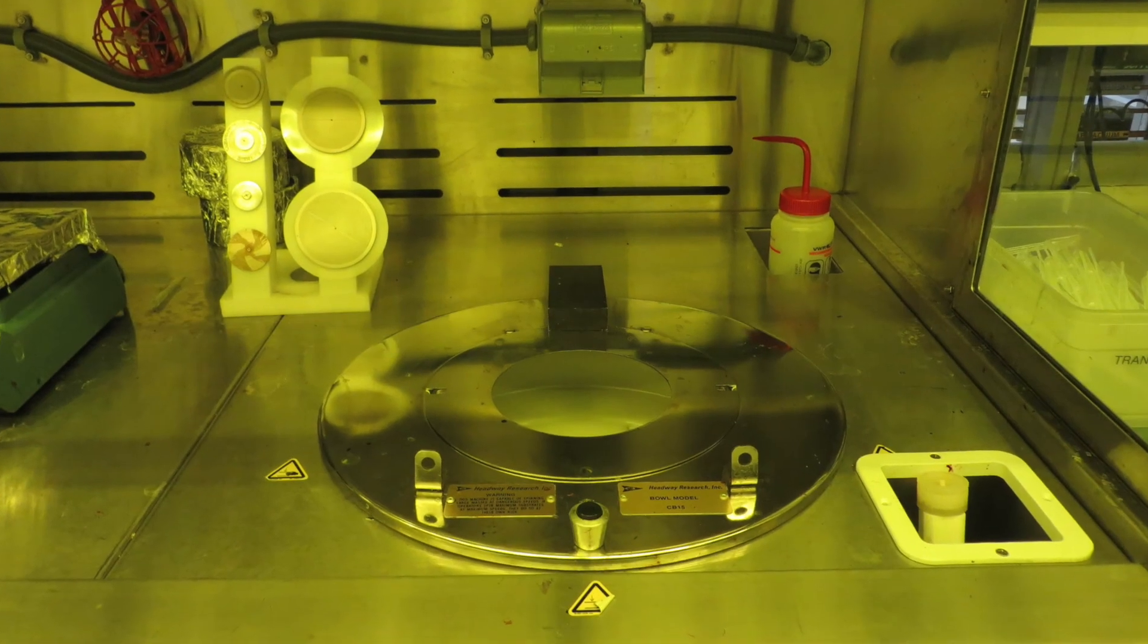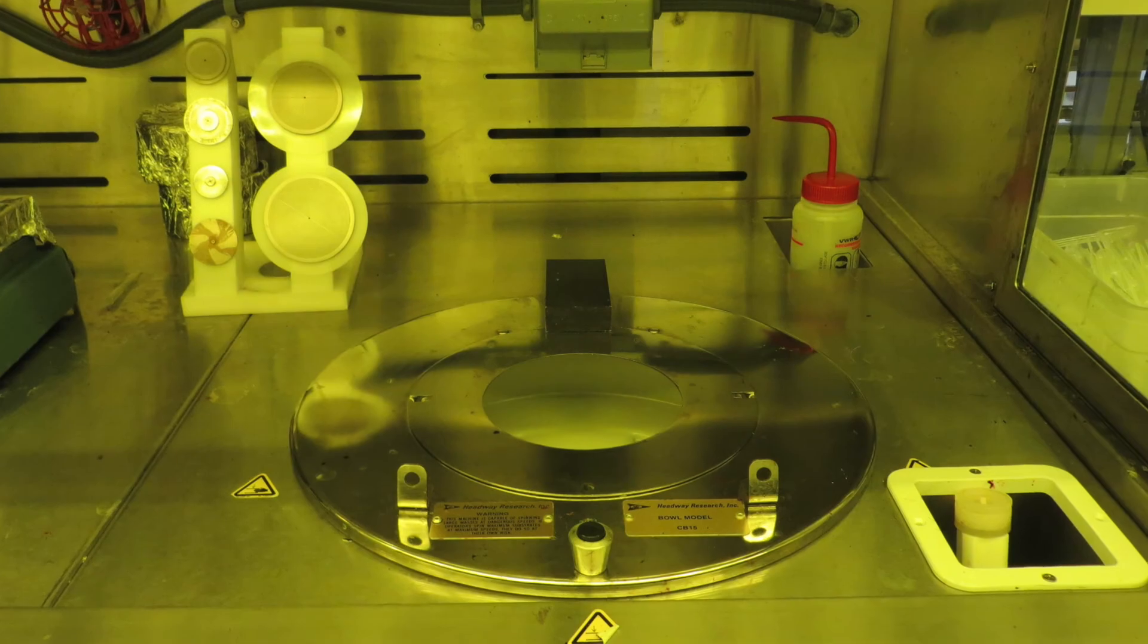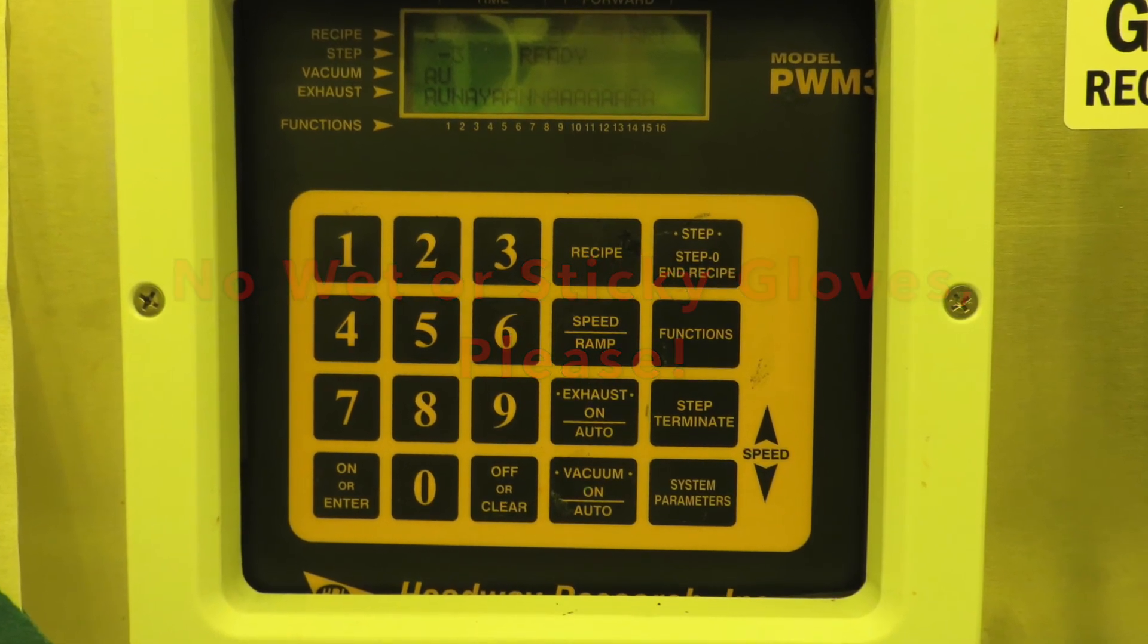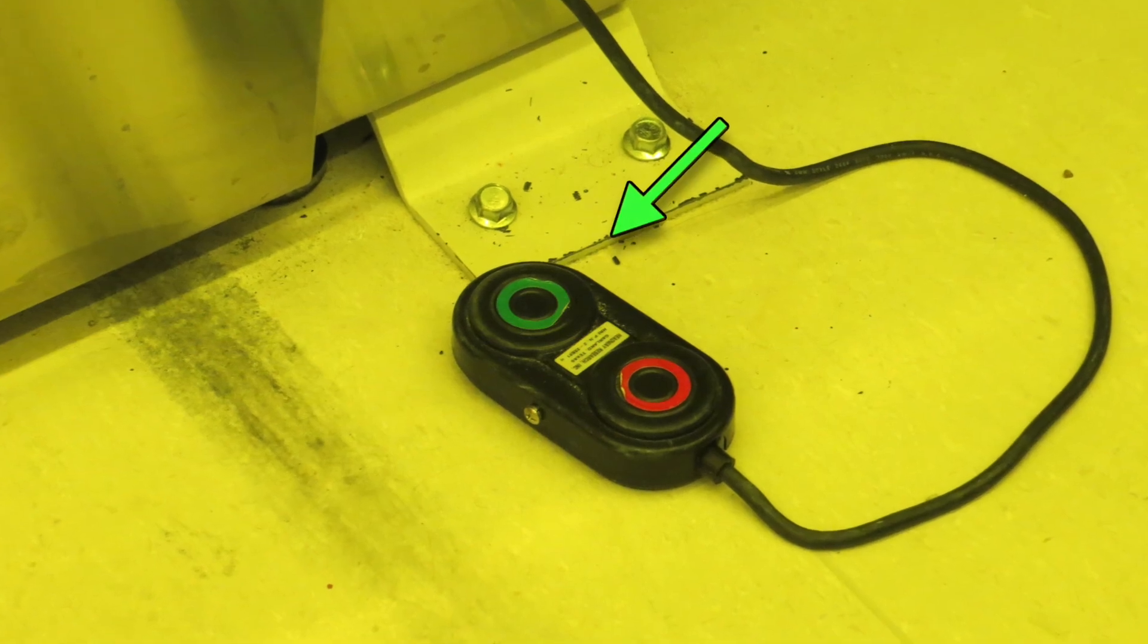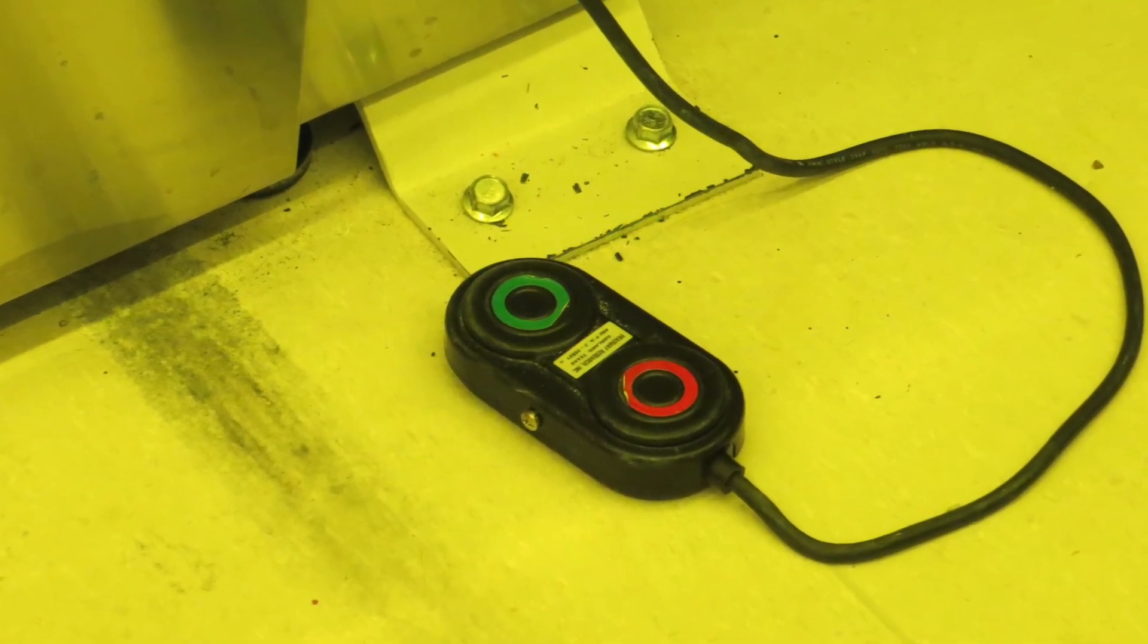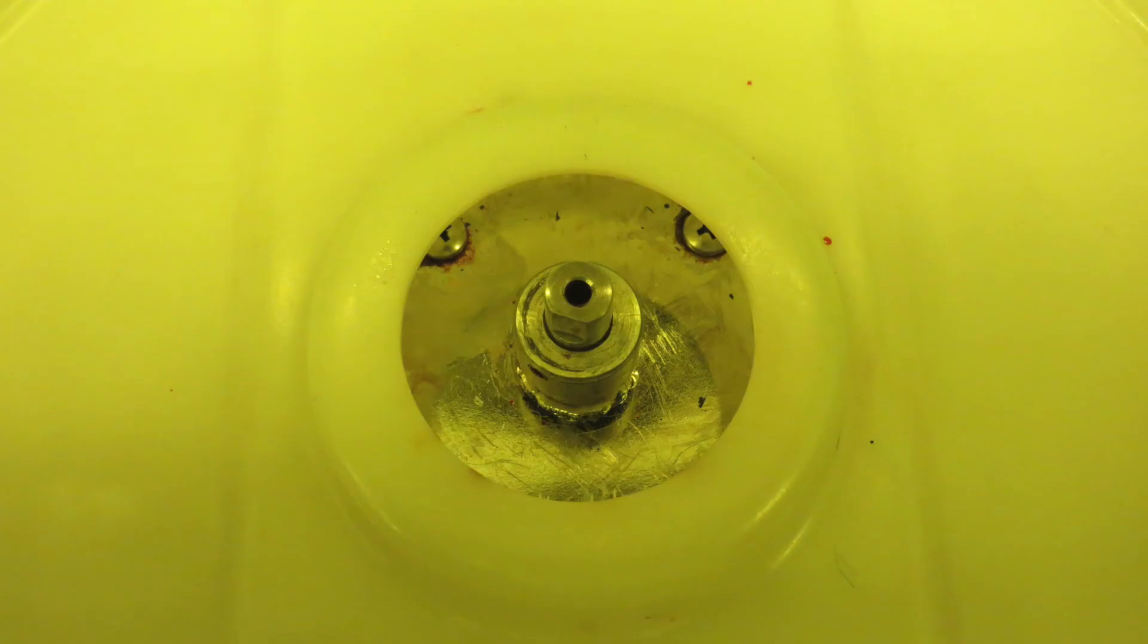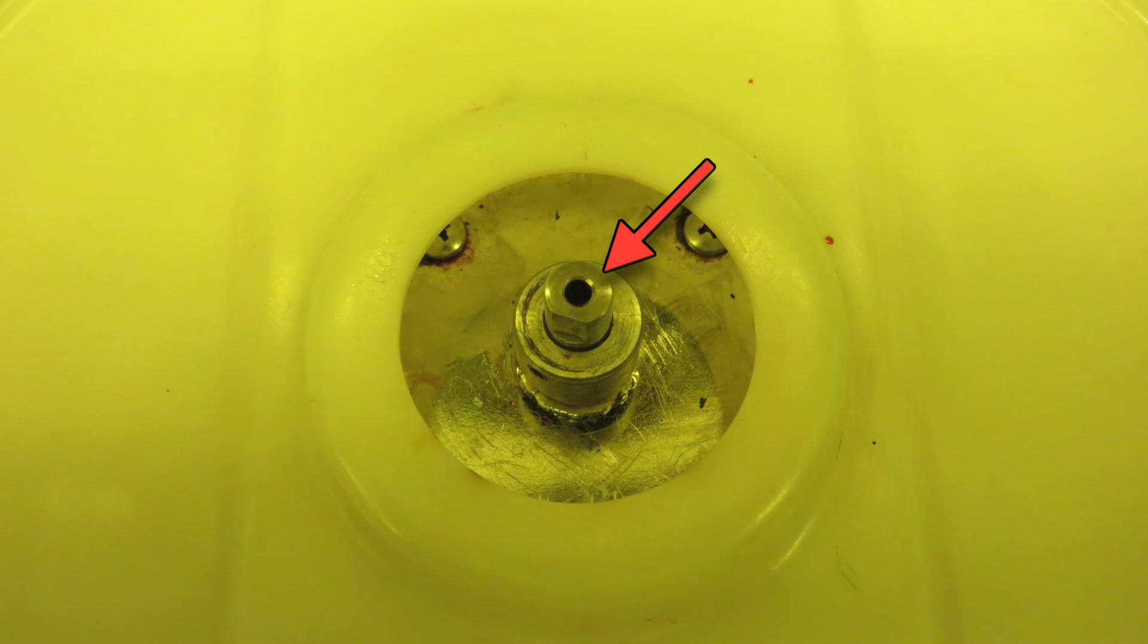The programming controls for the spinner are up above in the head casing of the wet bench. A green foot switch down below starts the automatic spin process. The red foot switch kills the process if necessary.